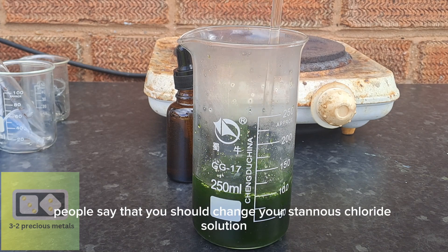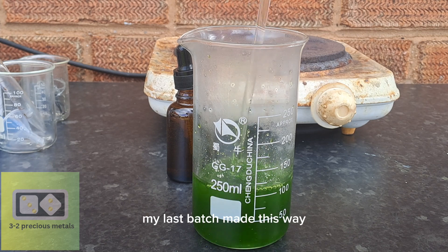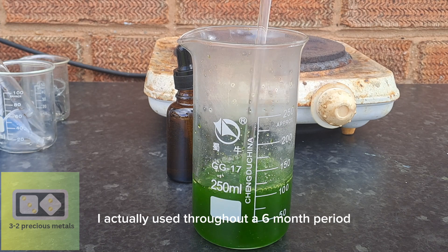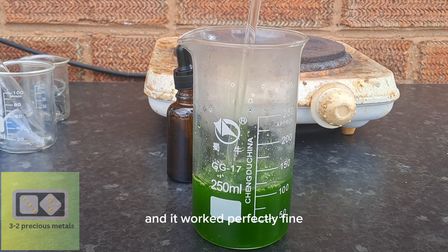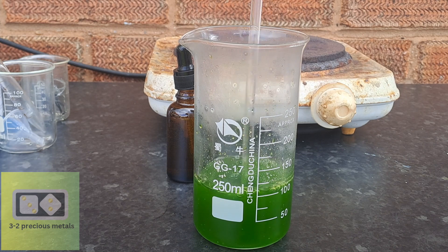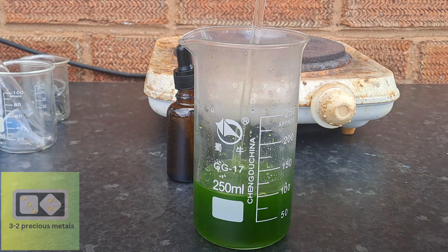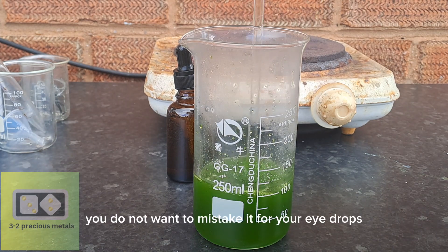People say that you should change your stannous chloride solution every month or so because it spoils. Just remember to keep it out of reach of children and mark the bottle clearly — you do not want to mistake it for your eye drops.